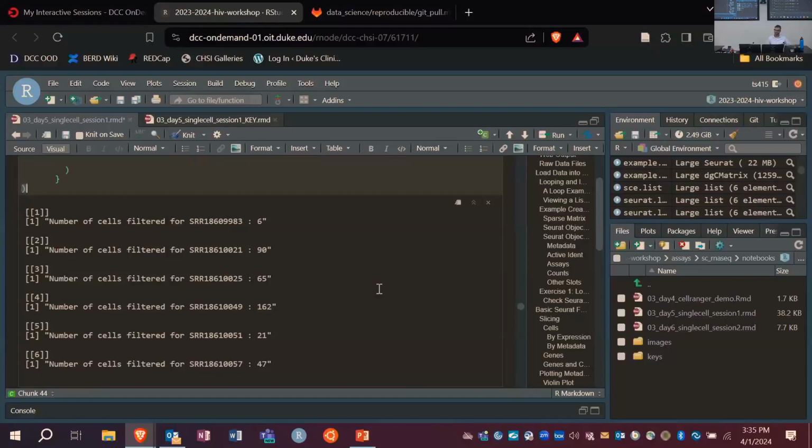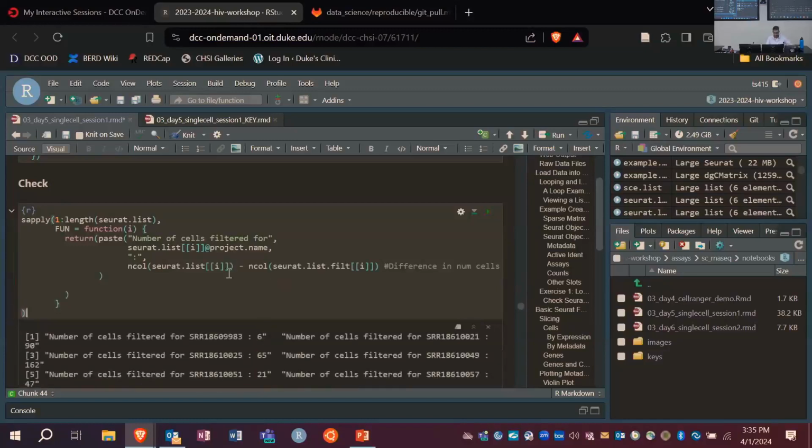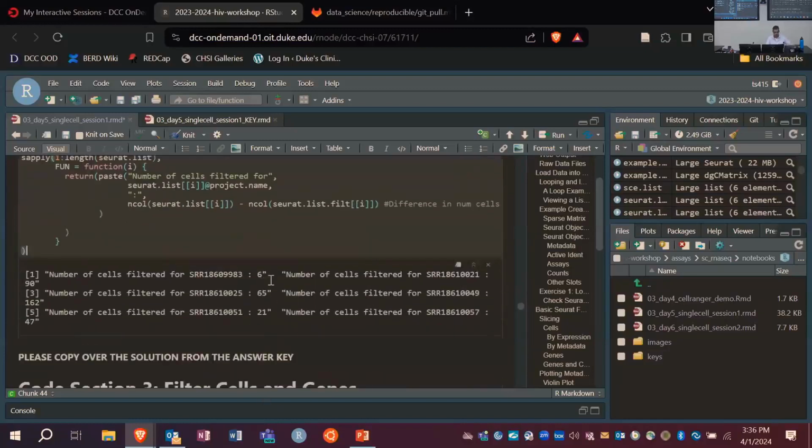As far as I understand, sapply is really just a simple output version of lapply, where it'll try to coerce the list automatically to a vector for you. It'll actually coerce a data frame for you as well if you try to sapply and return a data frame instead of a character string like this. Although I found that it doesn't always get the transposition right. Sometimes it'll return the data frame transposed to what I would expect or want. But yeah, here I like sapply when I'm just returning a vector of things. Yeah. Yep. Good point though. Yeah, good question.